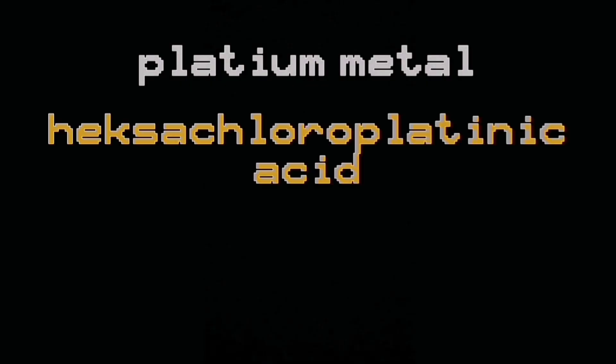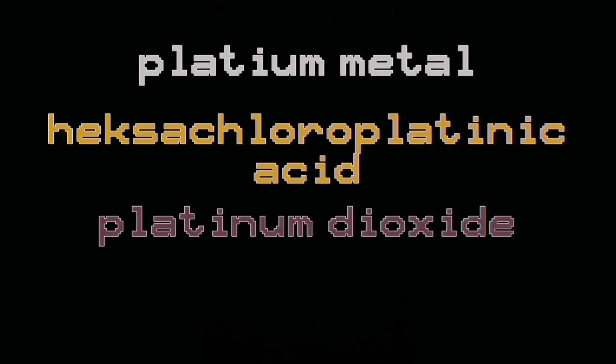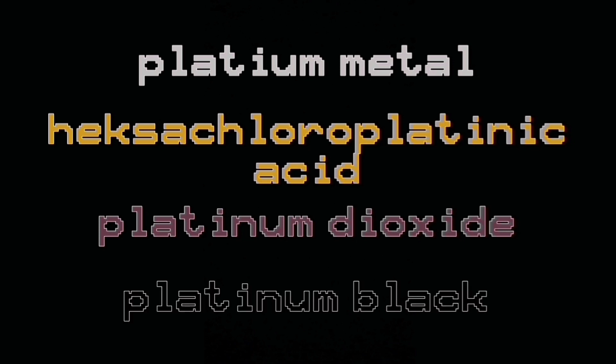Conversion to platinum black will be done in 4 separate steps, so the passivation will be taken away gradually. As we can see, from silver-white we go through orange-yellow, then brown to black. And that's what we're going to do.